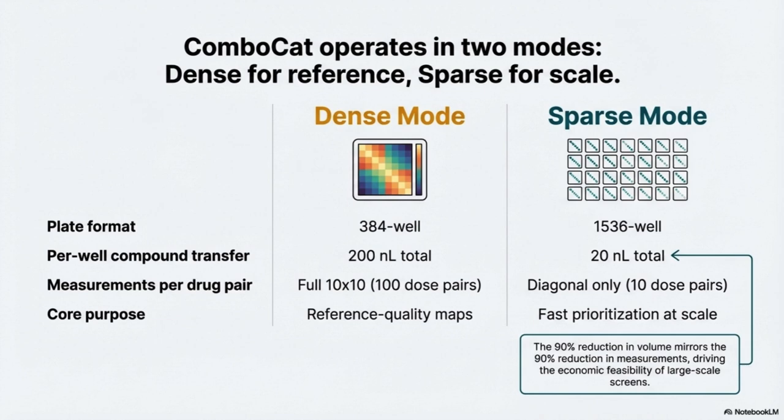What's so important for you to grasp here is that this is AI grounded in pure practicality. This isn't some vague story about generative AI. This tool is built around real physical constraints. Plate sizes, real volumes. Exactly. 384 well for dense, the ultra-miniaturized 1536 well for sparse. The economics of scale are just baked into its design from the start.